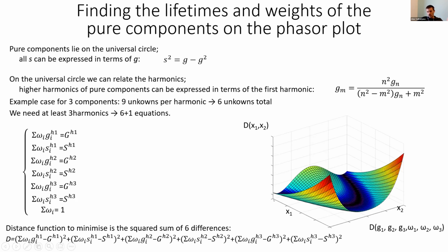is some surface on some n-dimensional space. In this case, I'm showing in a two-dimensional space your distance as a function of x1 and x2. But for example, in the case that you have 6 unknowns, what you have is a distance that depends on a 6-dimensional space beneath. So at each point in the 6-dimensional space, you have some surface, some height. And the problem is to minimize this surface so that the only points that satisfy all the equations are the points that make this distance equal 0. So this becomes a minimization problem, and what you have to do is start at random at some point and start shifting down till you find a point that's the minimum of your surface. That should be the point that satisfies all those equations.